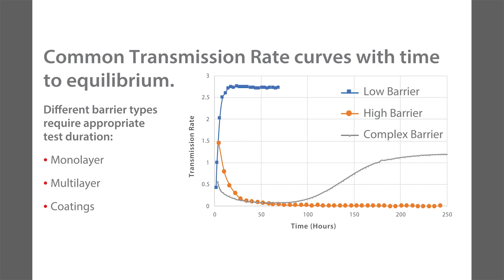So in our laboratory, because we are an ISO 17025 accredited laboratory where we run permeation tests, we define that we're looking for a steady state over 24 hours. Now, in these two examples, they could actually take a really long time to test. So in our laboratory, because I offer service, we maximize: we'll test at a maximum for 5 days. And that's when we call a test done.